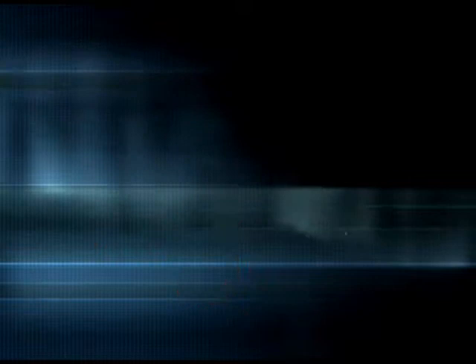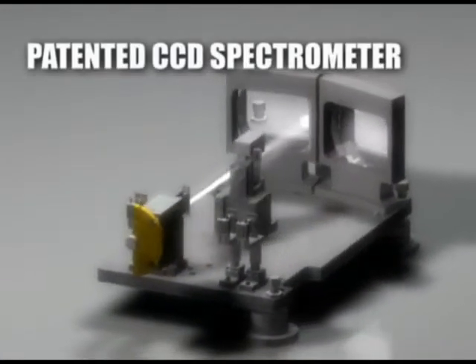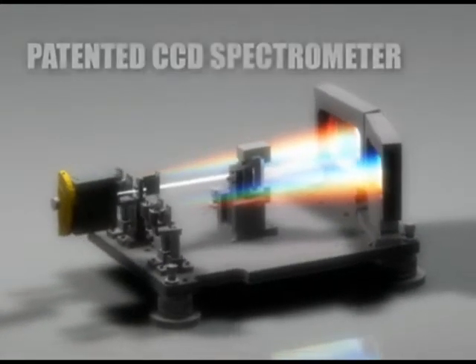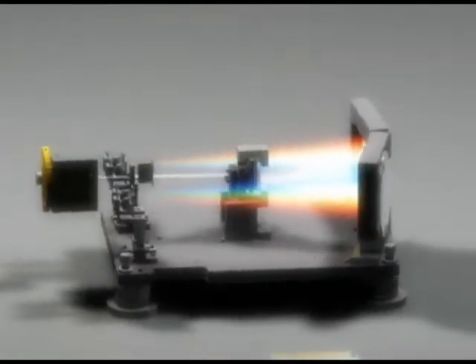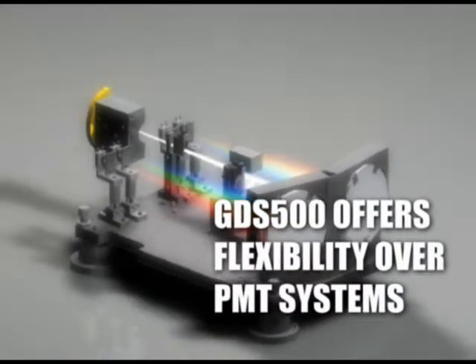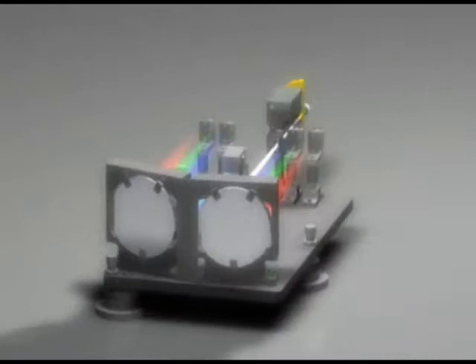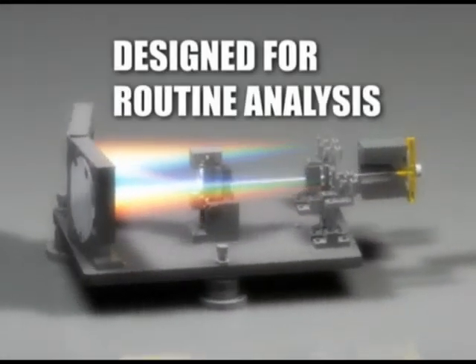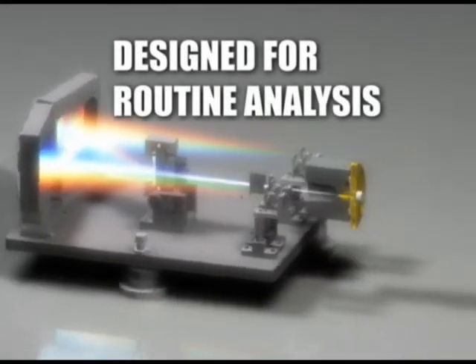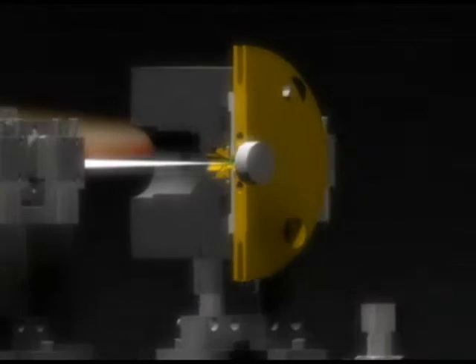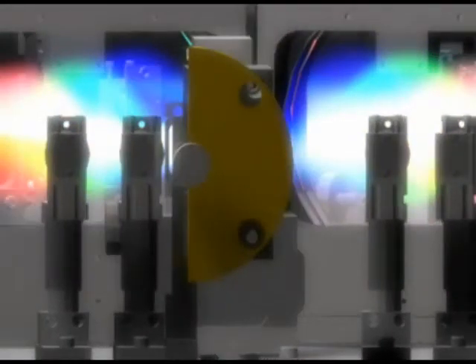The Leco GDS500 utilizes a patented solid-state CCD spectrometer, which provides flexibility and expandability. The ability to acquire the entire spectral range simultaneously is impossible using traditional PMT spectrometers and many other CCD spectrometers. The Leco CCD spectrometer, coupled to the latest in Microsoft Windows application software, makes the GDS500 quite powerful and well-suited for routine analysis.